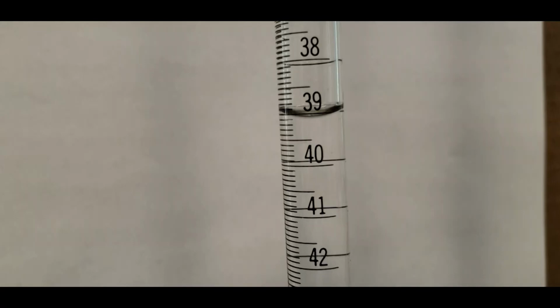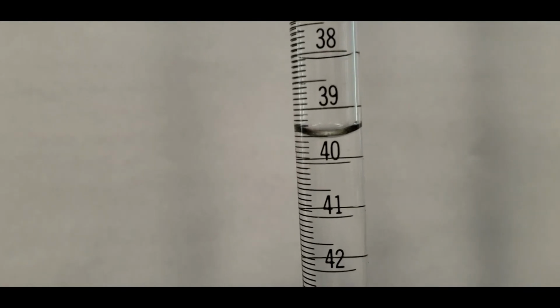All right, here's the burette with the solution flowing. Each of those numbers means a mil. You can see that we're coming up on adding 40 mils right there. And then each of the little markings, that's a tenth of a mil. So that's 40.1, 40.2, 40.3.